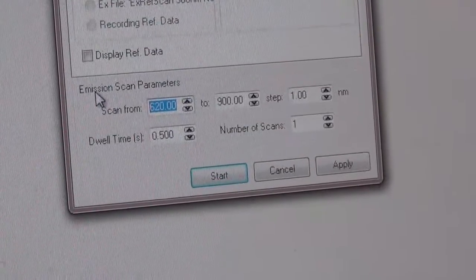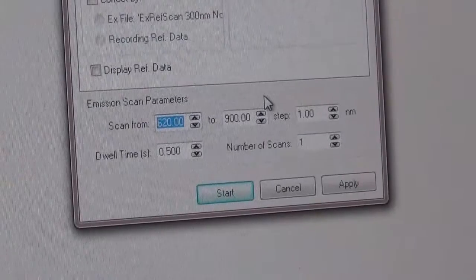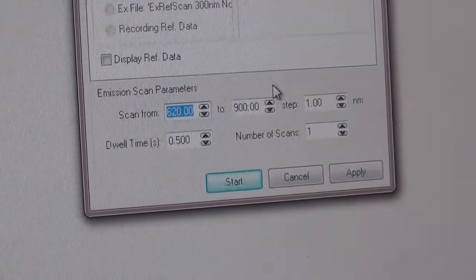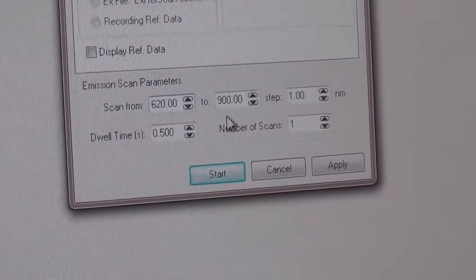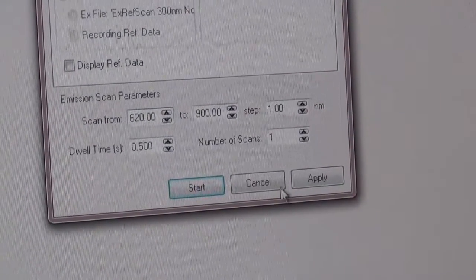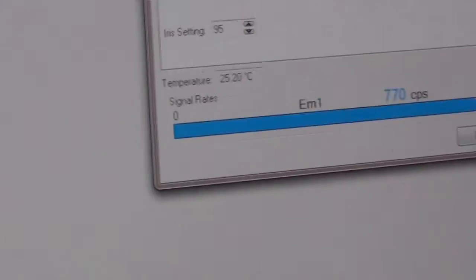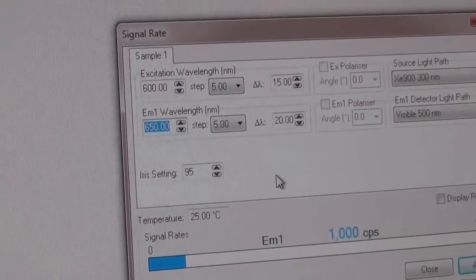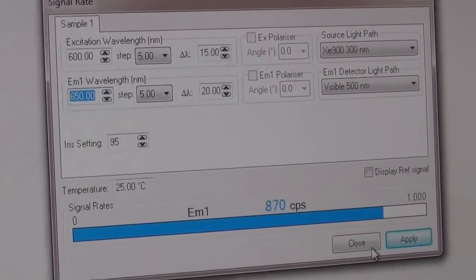So the scanning range will be a little bit longer than the excitation wavelength that you have predicted. The excitation wavelength you have predicted is 600, so it should be a little bit longer, 620, and not more than the predicted emission wavelength. The predicted emission wavelength that you have set just now, I show to you again, is 650. So the scan range should start from in between these two values. So 620 will be okay.